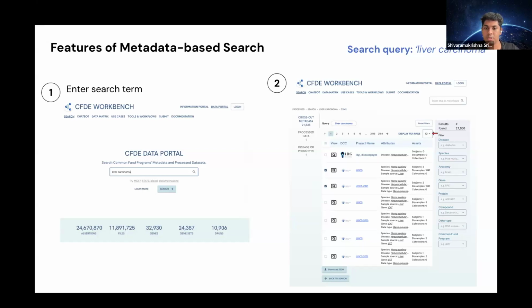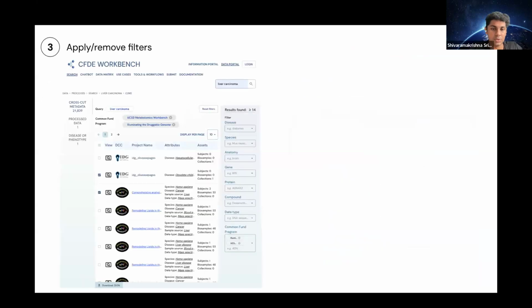Now that you apply filters, you can also have much more fine-grained control when it comes to these cascaded filters. As you can see here, the filters are organized neatly by the category that they belong to.